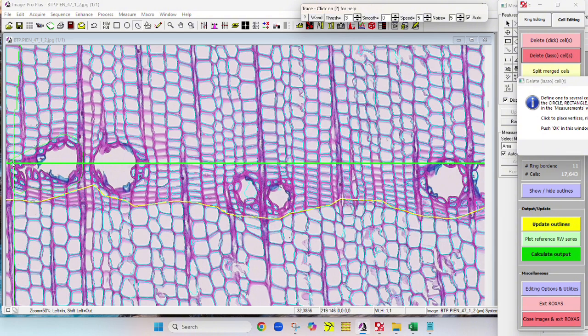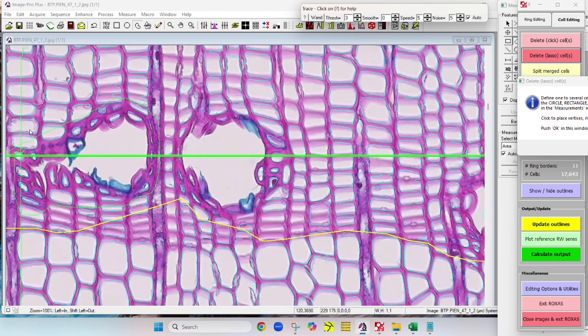And if you make a really big border hit this and you have this huge chunk of this ring get erased, you'll need to undo what you did. And every once in a while the undo last action tool doesn't work. It's happened once or twice where I did something like this and I wasn't able to undo it. So just try to avoid doing that. I'll avoid it by getting really close to the edge, going around whatever feature I'm trying to lasso and delete, and then get close again, and then right click, so it does this.